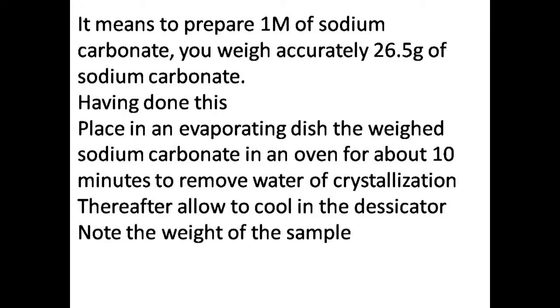Having done this, we go by the following experimental procedure. First and foremost, because at times during production the sodium carbonate might still contain some water of crystallization, it's necessary that before we begin to use it to prepare our standard solution, we evaporate this water of crystallization.